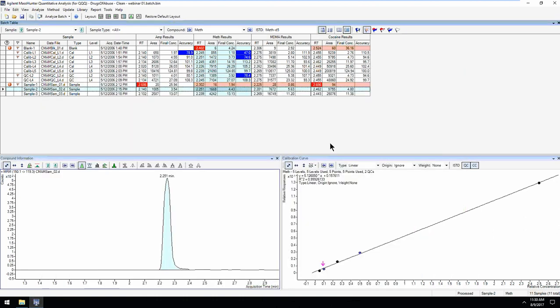Okay. All right, thank you, Howard. In fact, we do have a question, although this, Steve, might be more for you, since this was asked a little bit earlier on. How do you designate a target value for QC so that you can see the accuracy or outliers for those QC samples?